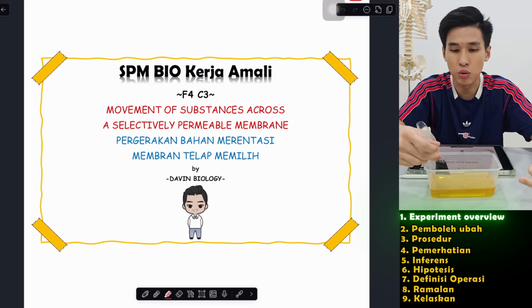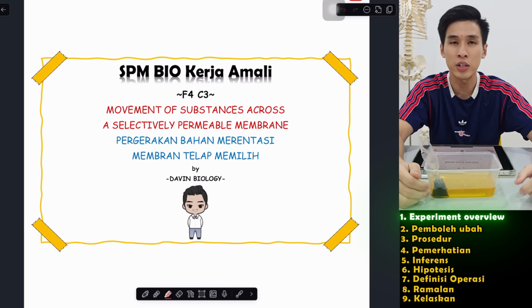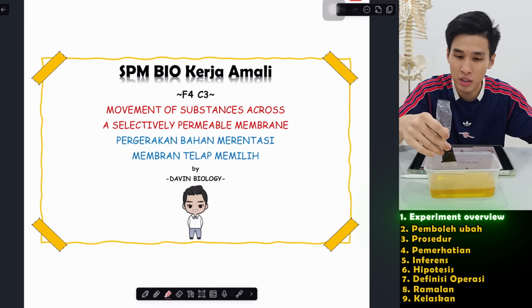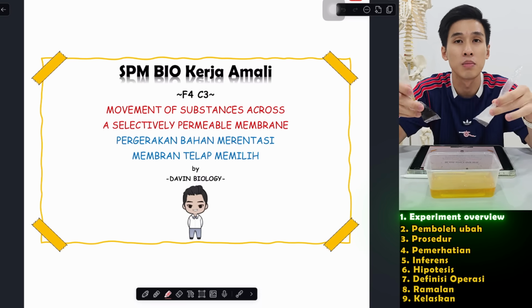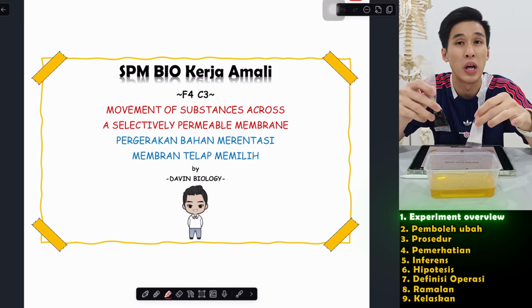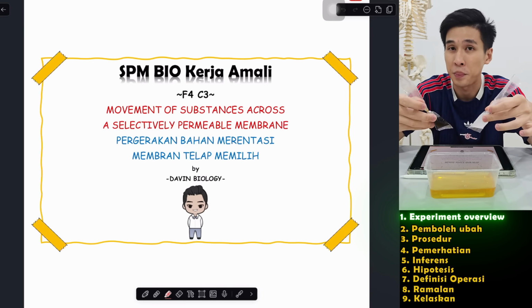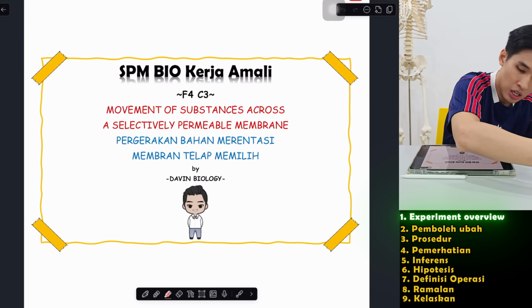So that's why a lot of students, they ask me, teacher, saya tak mau buat itu eksperimen. I want to straight away do question can. Since I already know menjadi biru tua. Now I just received news that there could be two different substances dalam dua Tiub Visking. So this one will paksa you to do the experiment because you got to record the correct observation. Okay? So I'll explain about these two more in a while.